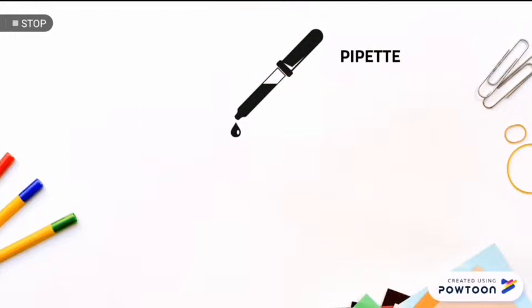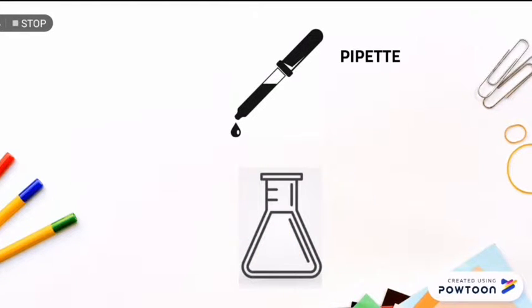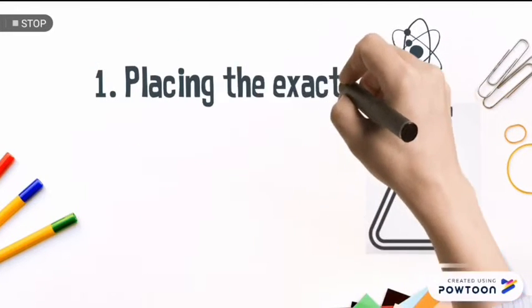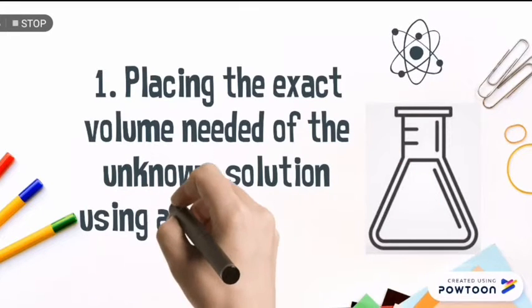A pipette is usually used to measure the exact volume of the unknown solution to be placed into the flask. A burette is then used to measure the volume of the known solution that will be added to the unknown solution. The solution placed in the burette is called the titrant, while the one in the flask is the analyte. The first step in titration is placing the exact volume needed of the unknown solution using a pipette to the flask.